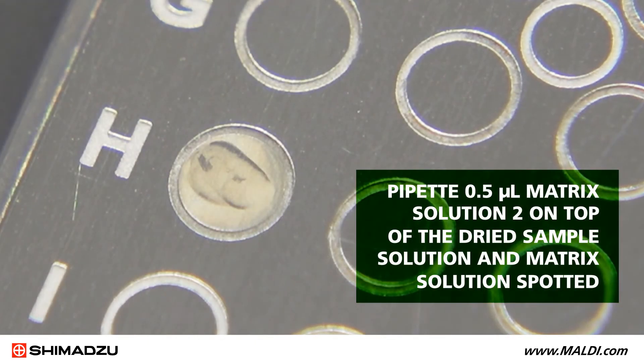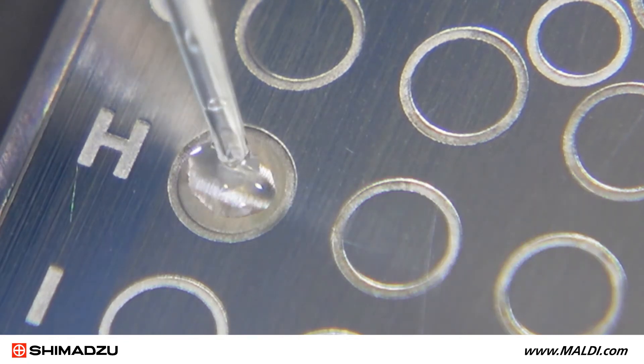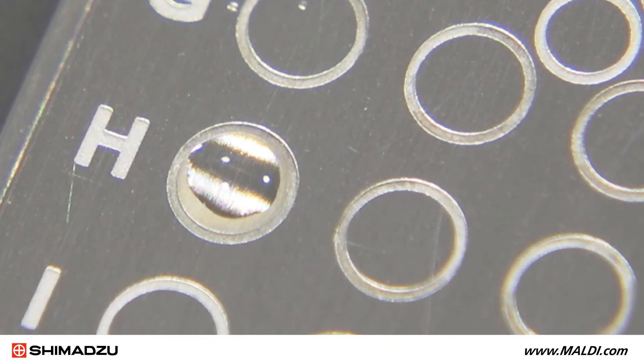Pipet 0.5 microliters of matrix solution 2 on top of the dried sample solution and matrix solution spotted. Then aspirate and dispense using the pipet three times to mix the sample and matrix. Allow the plate to air dry.